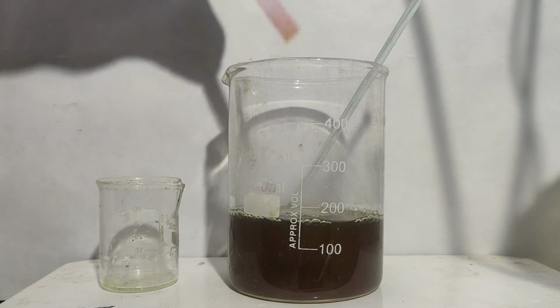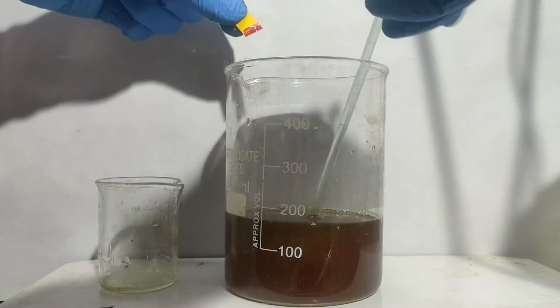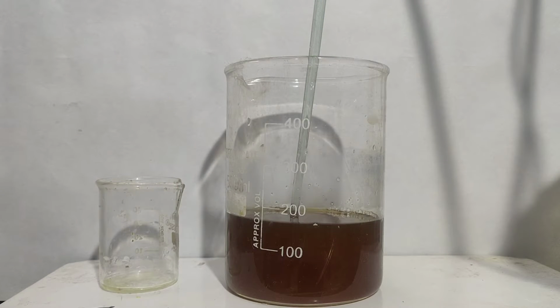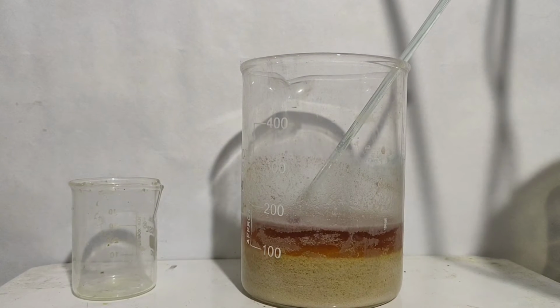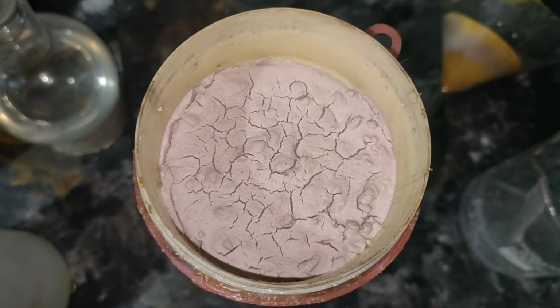I checked the pH of it and it was highly acidic, but no precipitate was formed, so I thought the reaction had failed and left it. After some time, when I came to my lab, I saw a bunch of precipitate, which may be naphthionic acid. I filtered it on a Buchner funnel and it appears to be light pink in color.